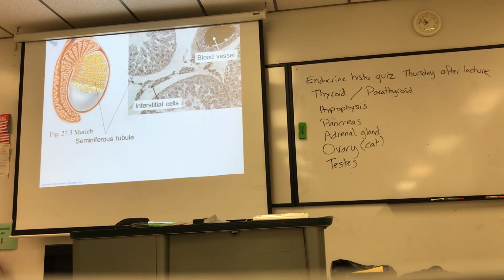If you come to Open Lab, if you're in this room, you can just access these boxes directly. It's box A, B, and C, and each box, if you haven't used these before, has all these trays in it. You pull out one tray, there's 12 trays, but there's a left and a right side. And so let me write the locations of this.